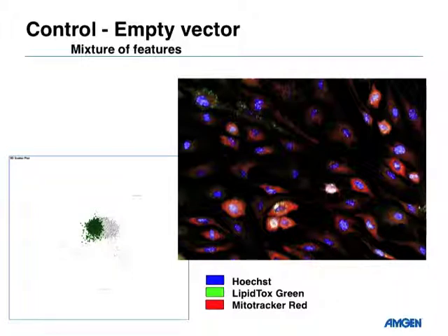But the nice thing about viewing this in principal component space is that you can see things that are lumped together, not just along a one-dimensional axis, because the second principal component pulls things off the axis. You can see things that are grouped together that way. We can then use some different clustering methods and find different clusters within that principal component space, and that's been very promising.